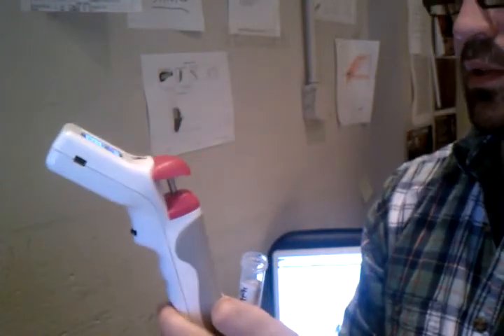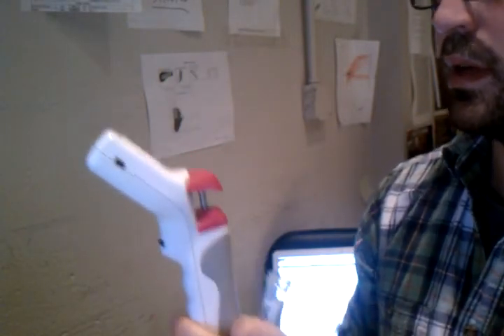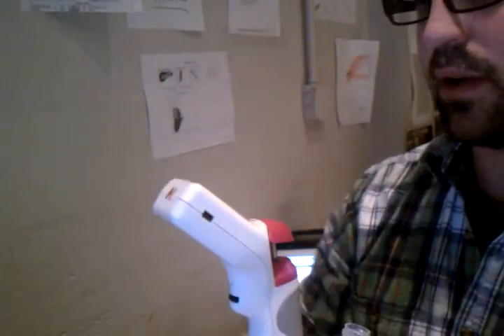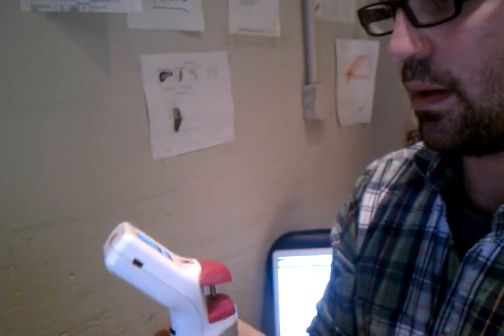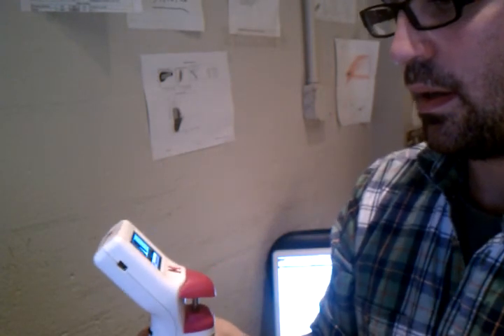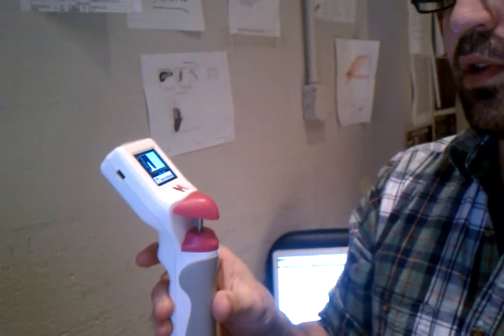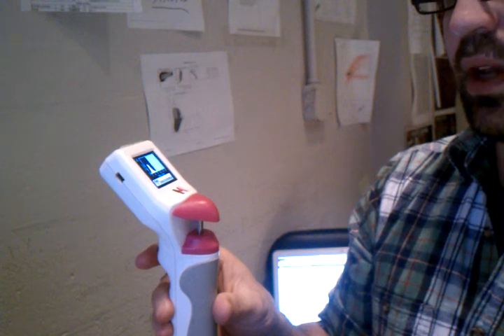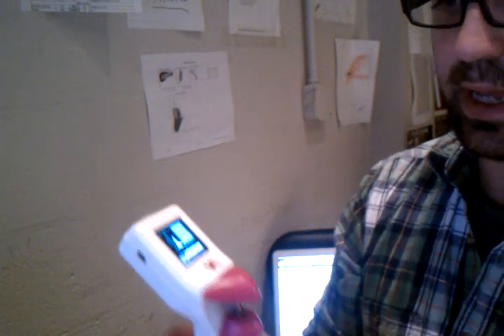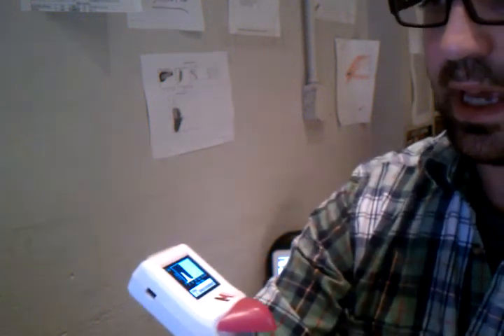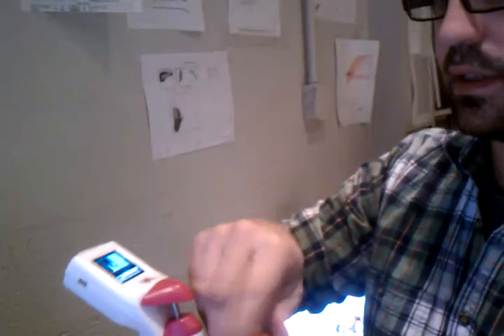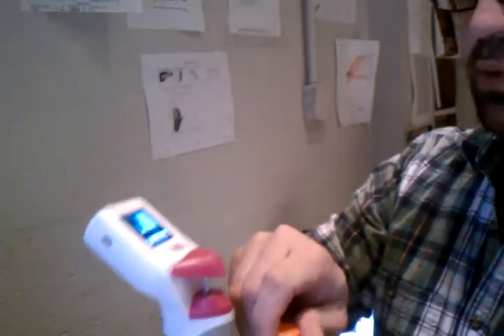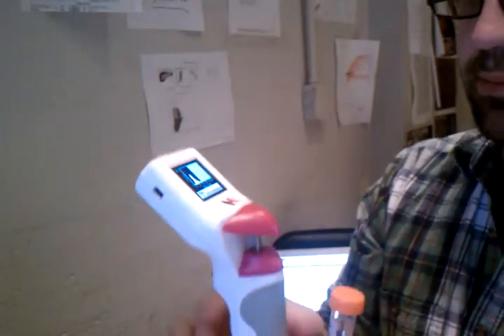So now the count I'm getting is about 300,000 per mil. Again, that's excluding all those bubbles. So you get a much more accurate count pulling it upside down.